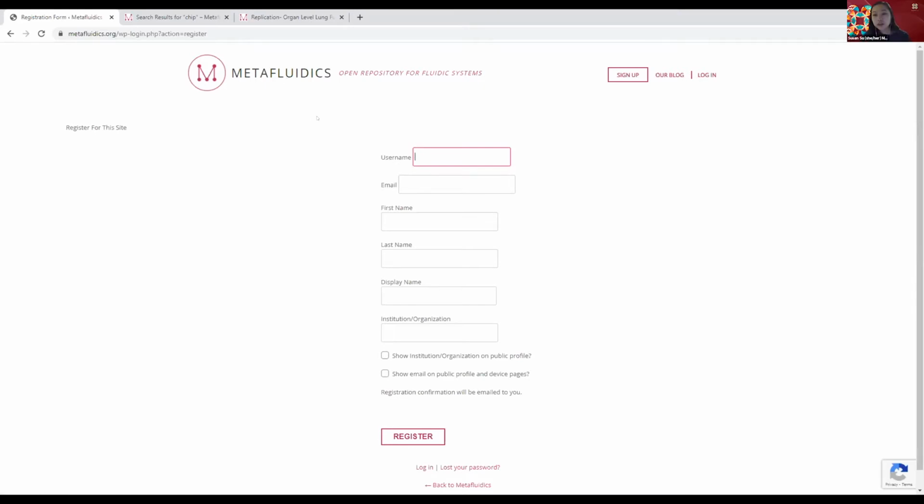While we're waiting, does anyone want to shout out their favorite part? Favorite design? There's this one valve that they call an LED valve that's an indicator of whether or not fluid goes through. I just think it's a really neat device that's on the site. We posted about it on social media. Yeah, that's my favorite part on the site.